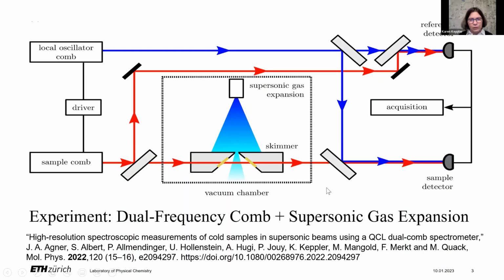Now, I won't spend too much time on this because Markus has already discussed things very well. I would just like to do sort of a "you are here" sort of thing to let you know where we measured. I've said that we've measured two molecules. The CHCl2F was measured in combination with N2O. This was rather a weak signal, so we measured this without skimmer.